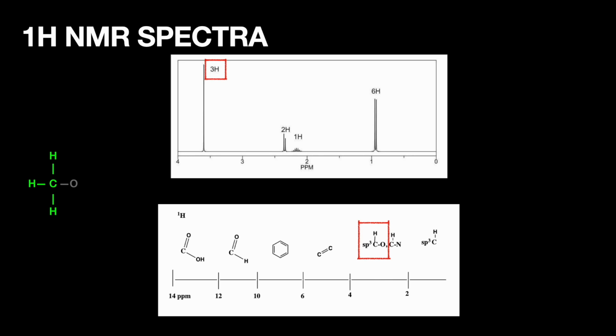The number of peaks for any data point is used to calculate the number of hydrogens on atoms neighboring the target atom. To do this, we use the n+1 rule, which simply states that there will be one more peak than the number of hydrogens on the neighboring atom. This target atom must then have 0 hydrogens on its neighbors.